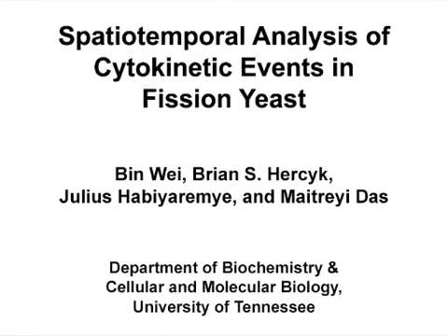The overall goal of this live cell microscopy technique is to study the spatiotemporal events that occur during cytokinesis in the fission yeast model system. This method can help answer key questions in the cytokinetic field, such as the molecular details of the different stages of cytokinesis over time. The main advantage of this technique is that different spatial components of the cytokinetic machinery can be analyzed over long periods of time with minimal toxicity to the cells. Though this method can provide insight into cytokinesis in fission yeast, it can also be applied to budding yeast and other fungi.